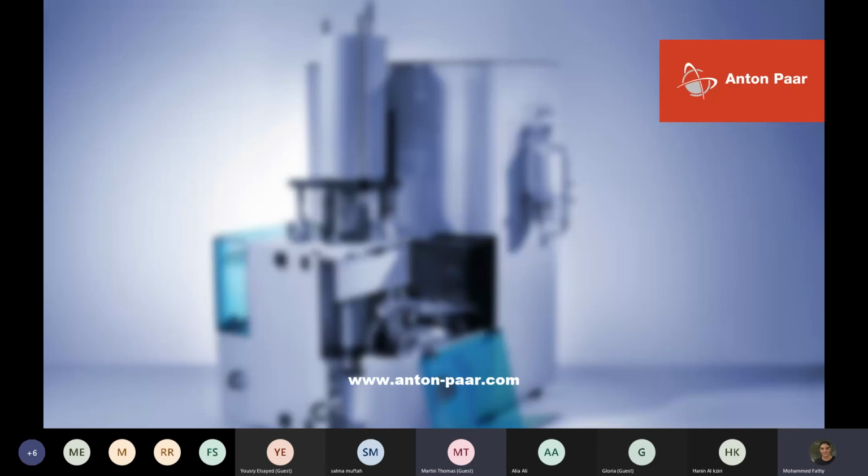Then you wash down the sample, recover the sample. Now that sample will have mercury inside of it. Okay, we can't prevent that completely. So what we have to do then is store that safely, okay, in a closed container in the fume hood. And when a reasonable amount has been accumulated, then we have to contact a waste disposal company that handles hazardous waste and have them dispose of it responsibly.